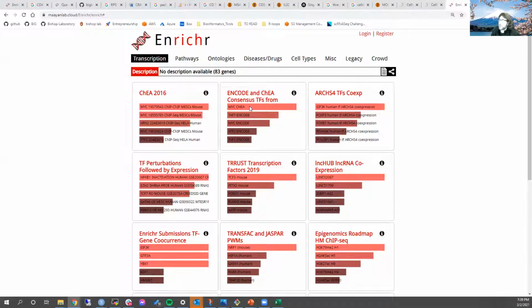So the fact that I'm enriching for these genes in cluster 0 might tell me that I'm seeing an overexpression of MYC targets in my CD4 positive T cell subpopulation. Kind of interesting. I don't know if you guys are immunologists, but I thought this was super weird when I first saw it.